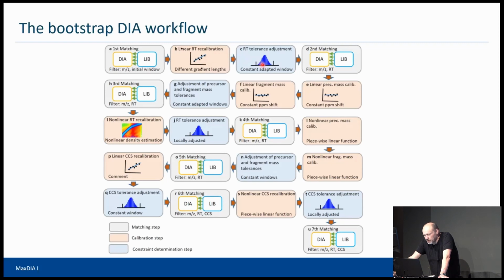And then now we can look at the retention time differences between the library and the sample. So one would get some histogram like this, and then one would cut this off, so that you get rid of the noise of matches that would be outside of this window, because then we know that these are wrong matches, right? So, based on what we learned from the data so far.